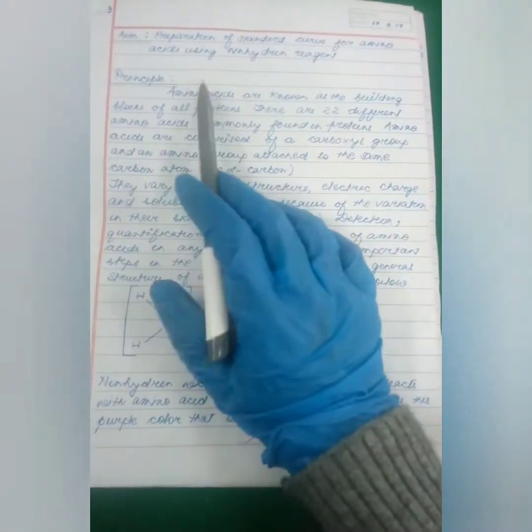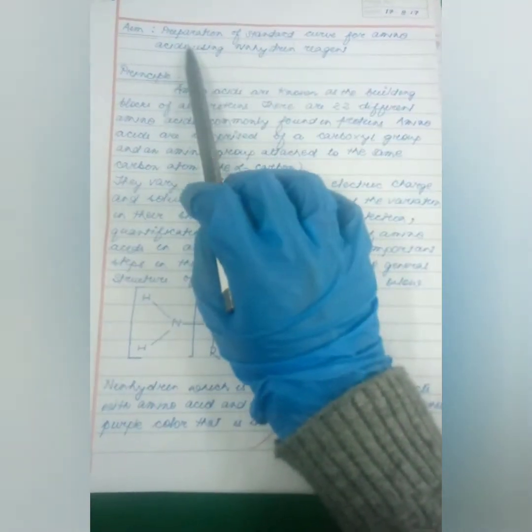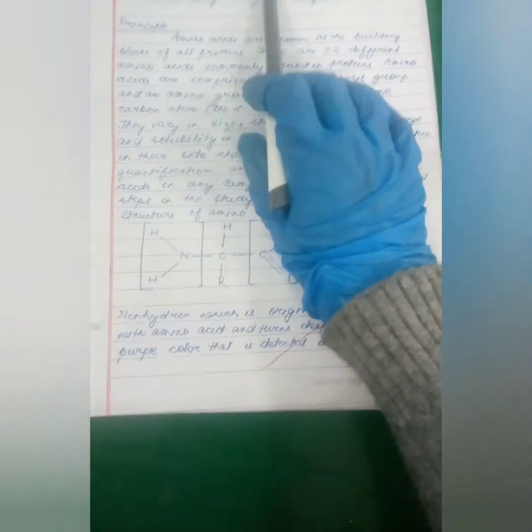In this experiment today, we are not only going to prepare a standard curve, but from the standard curve we will also find the unknown amino acid concentration.